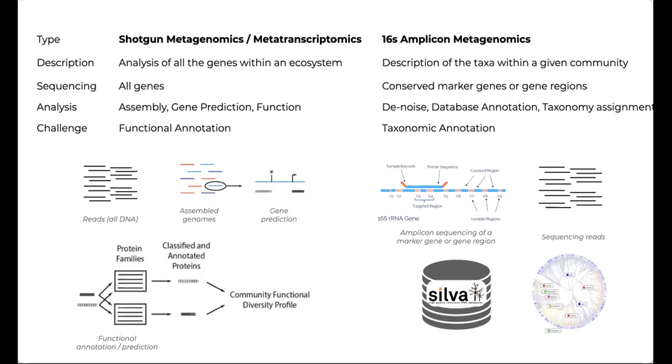Whenever we have sequencing data, we need to align it to a reference genome, right? In the case of 16S amplicon or rRNA sequencing, instead of aligning to an individual genome, we use a database of similar shorter sequences annotated by taxonomic rank. The primary database we will use is the Silva database, which has a classification of commonly found 16S ribosomal RNA sequences across bacteria, and we try to match them to sequences from our samples.